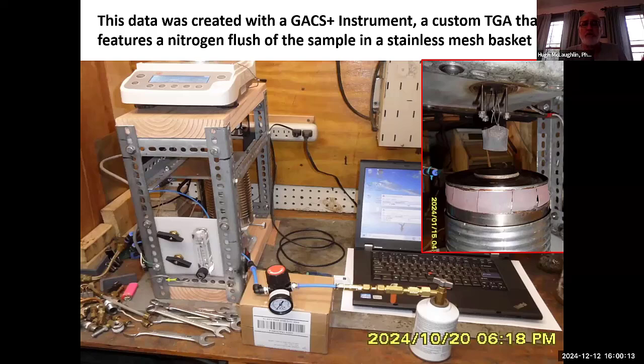So this is an instrument which, if you look in the upper right, takes a sample of your material in a very small mesh basket, hangs it below a scale, and then subjects it to a flow of laboratory nitrogen, bone dry nitrogen, and records the weight every 30 seconds, and collects a lot of data on what the conditions did to your material.